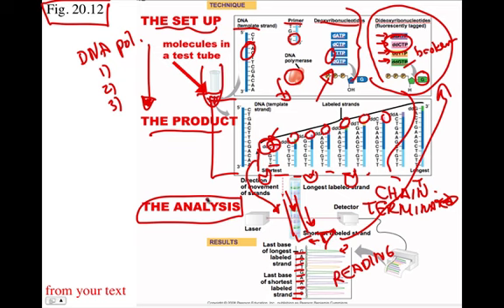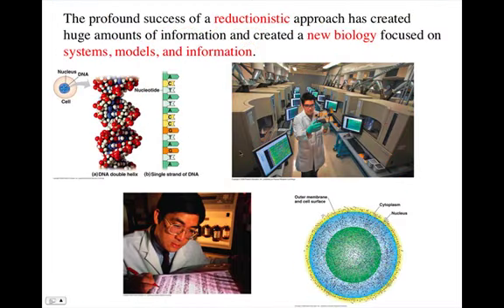And that's getting done in these instruments over and over, and it gets done really fast. And in the process, DNA polymerase can read about 700 nucleotides. And then it is impossible to read much further in this situation.